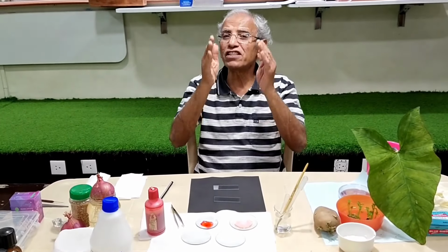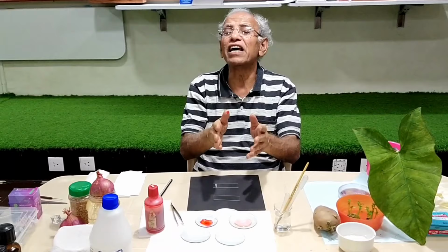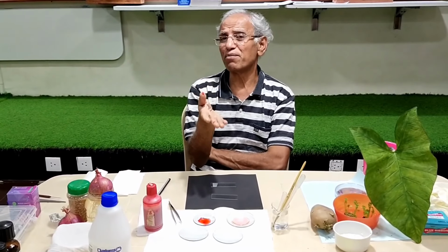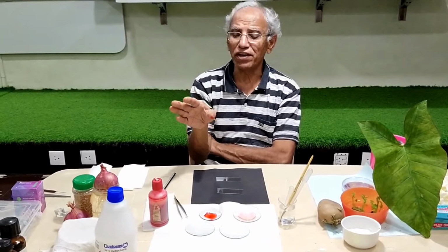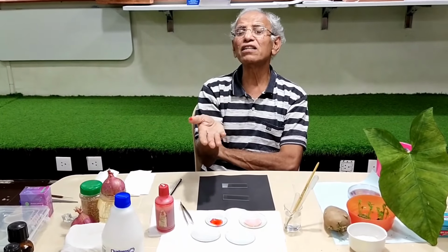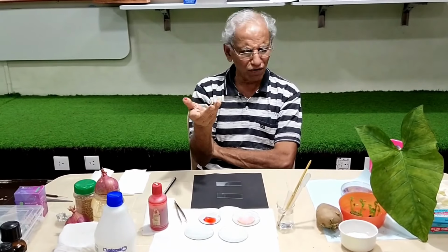You want the proteins to have their positions fixed, so that the stain will go and catch them. So proteins and many other materials get fixed, so fixation is very important. There's a lot of theory about how tissues are to be fixed. Now because this is fixed, it can be better stained. Without fixing, the staining may be weak, don't worry much about it.